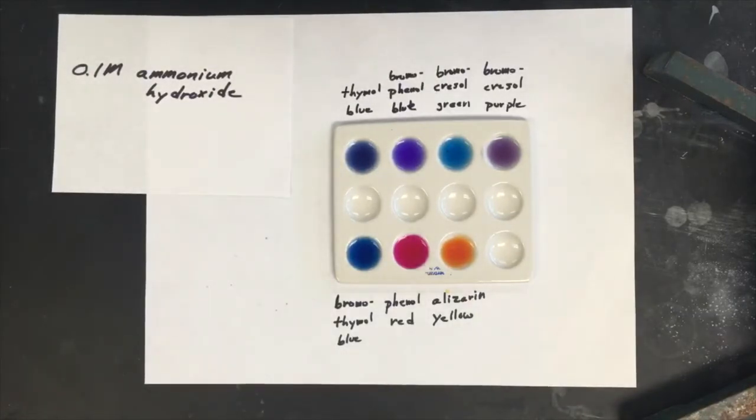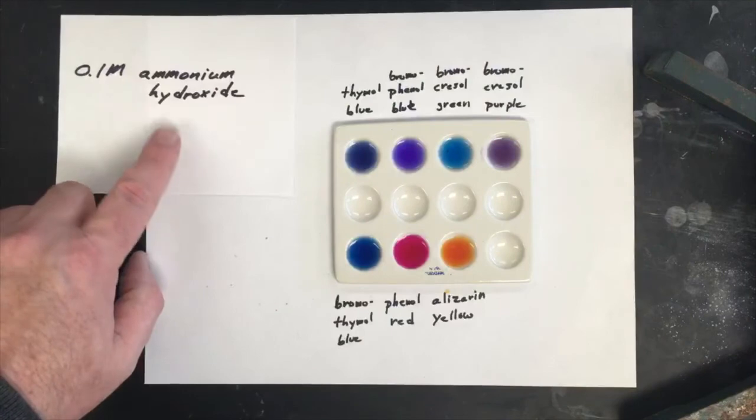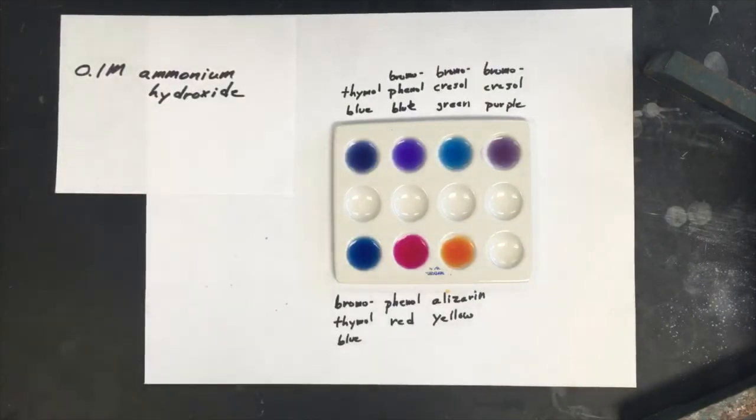Here's the next sample. We have 0.1 molar ammonium hydroxide. A lot of times that's also just written as 0.1 molar ammonia. Whenever ammonia is dissolved in water, it undergoes a reaction. And so that's why you can kind of see these two different names.